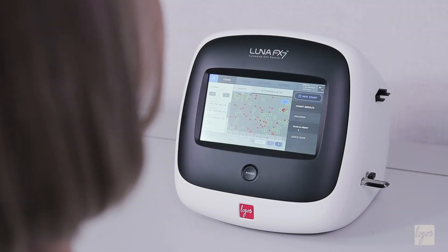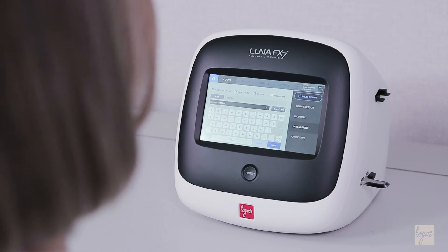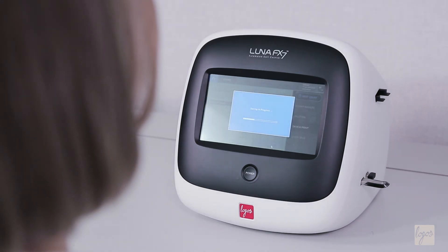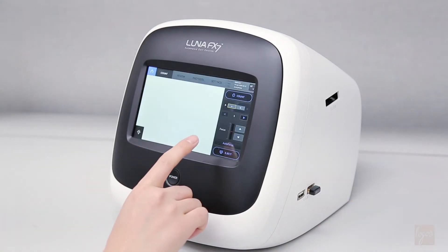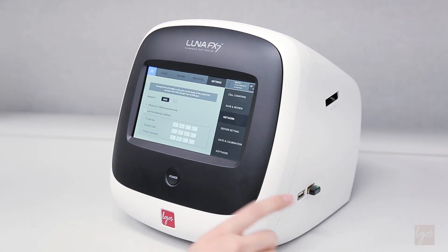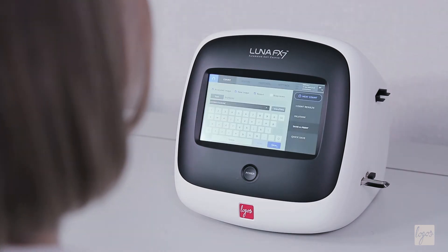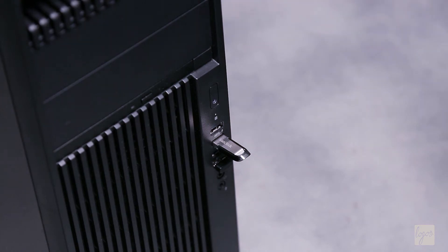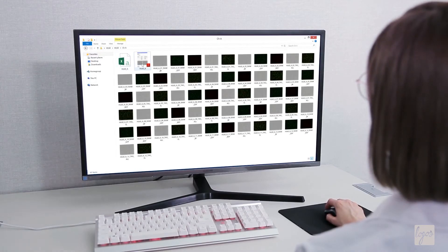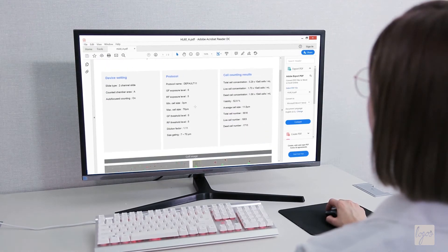The standard LUNA FX7 has a 250-gigabyte internal hard drive, requiring no additional computer. You are able to export data through Wi-Fi, Ethernet, or a USB flash drive. Counting results may be exported as a CSV summary or a comprehensive PDF report with raw and tagged images.